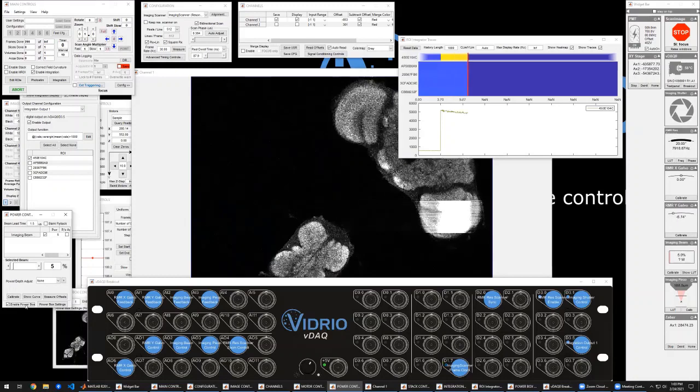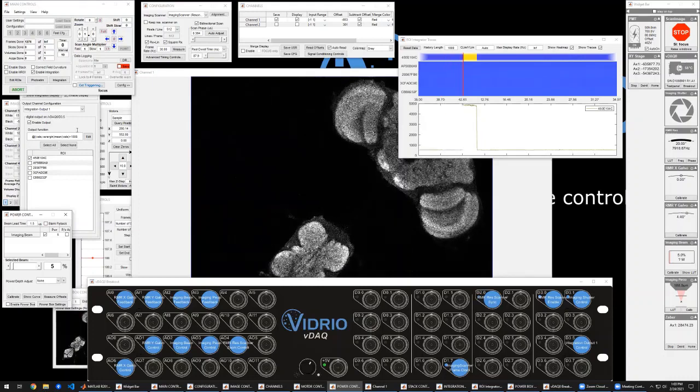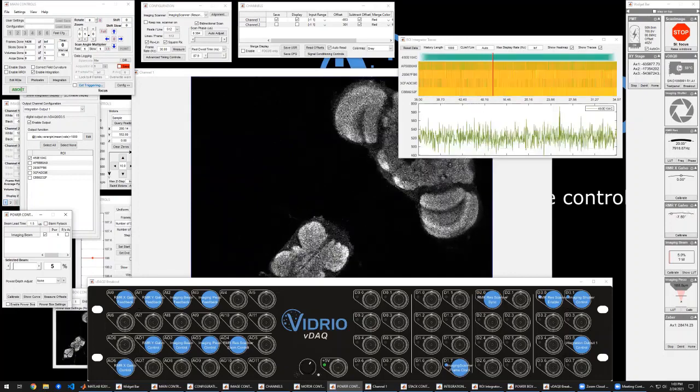So again, this is flexible. You can implement your own function here to process and determine what to send to the output. And if it's an analog channel, you can output an intensity signal that's proportional to the intensity of the activity in that ROI, or any kind of complex formula you need to make your experiment work. And then you can take this trigger and trigger some closed loop aspect of your experiment, whether it's some kind of reward circuit or anything else. So that's just a few ways that you might utilize this interface. So I'll go ahead and turn it back over to Bruce.